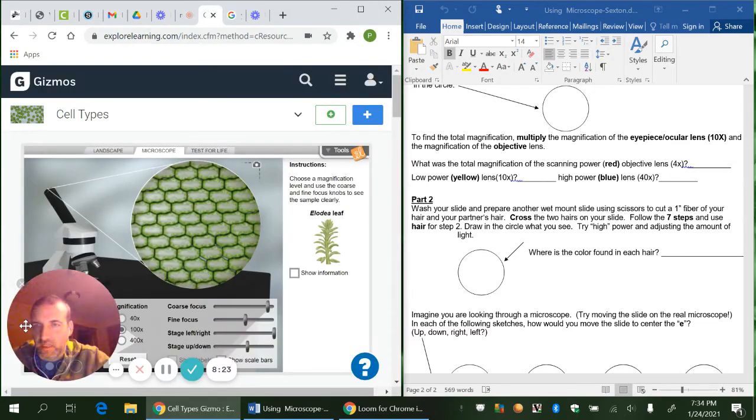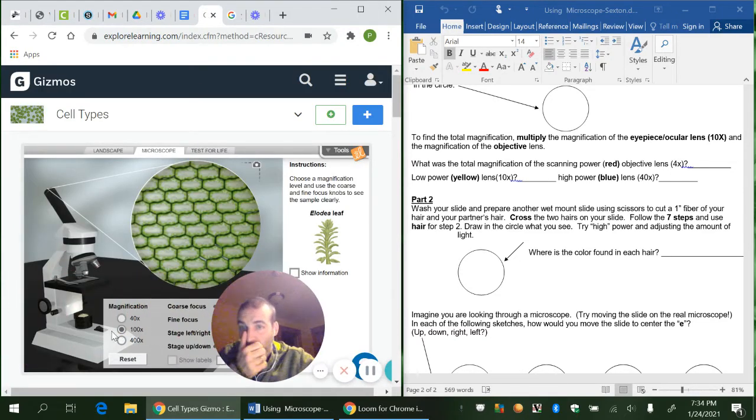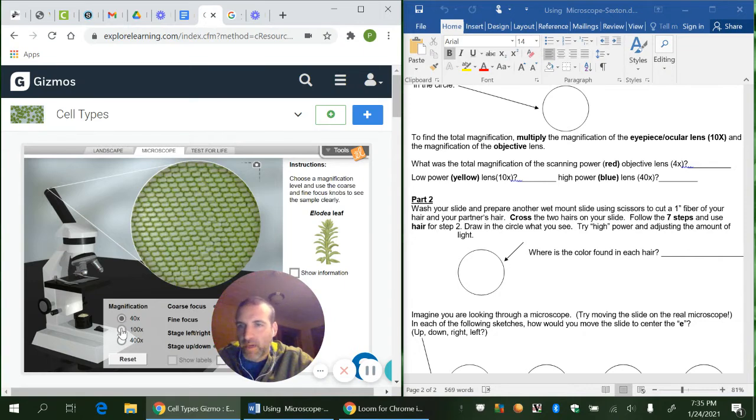So looking back at this gizmo, just to remind you that the eyepiece or the ocular lens is up here, and these three down here are the objective lenses. And as you change the magnification, they rotate on the revolving nose piece, is what this part of the microscope is called.